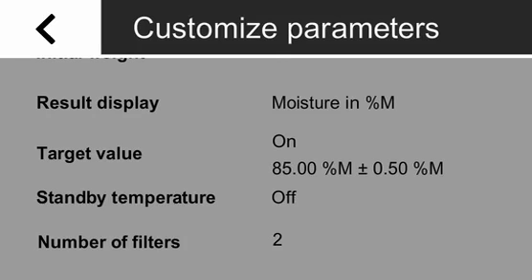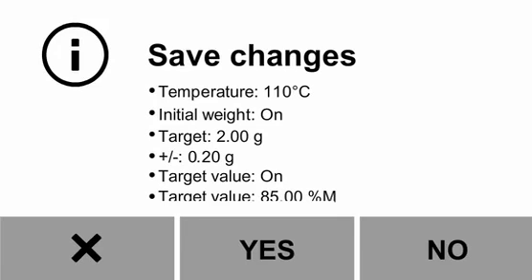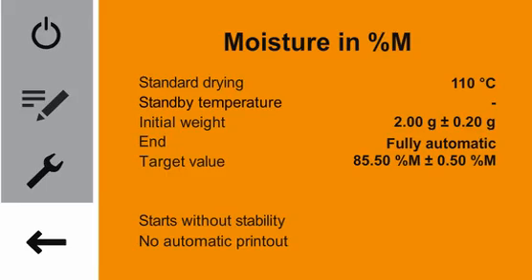You have now made all adjustments on the parameters for a pasty substance. Exit the window by tapping on Back. To save any changes, tap Yes. You are now in the main menu again. Please tap on Back.